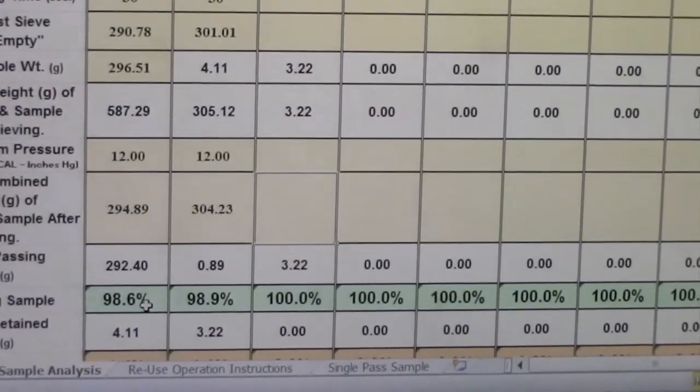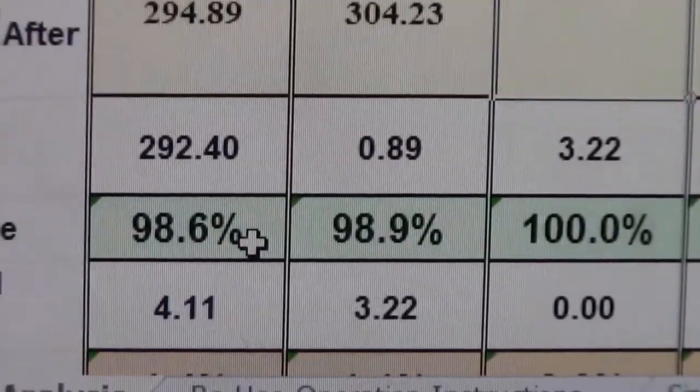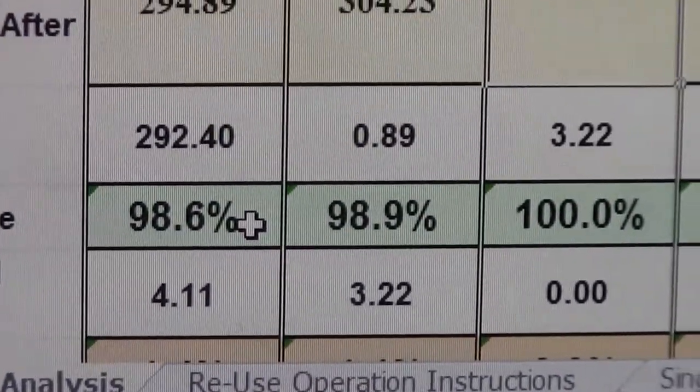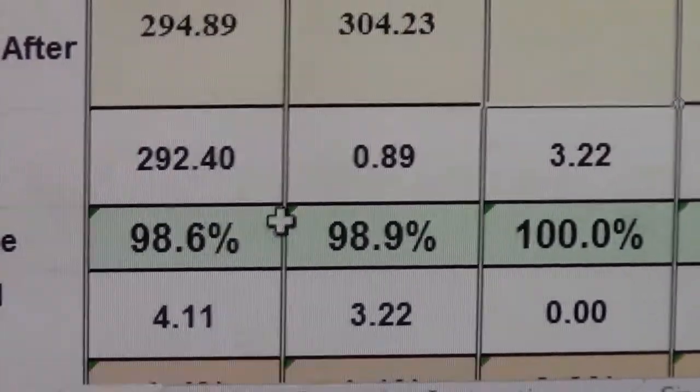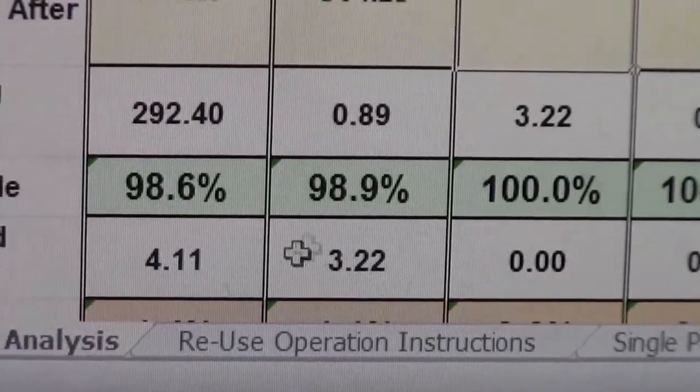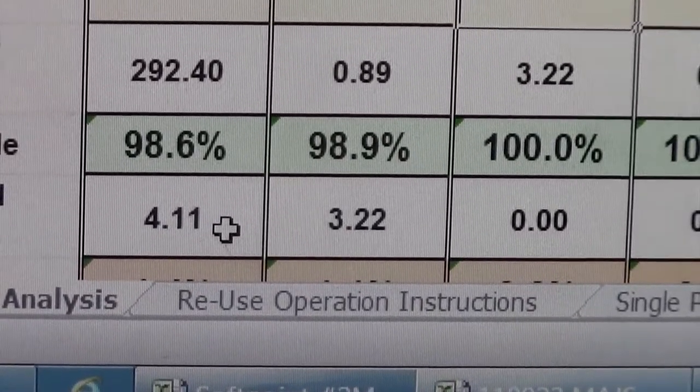As you can see, 98.6% of the sample passed through the 75 micron or 200 mesh screen, and the amount retained was 4.11 grams.